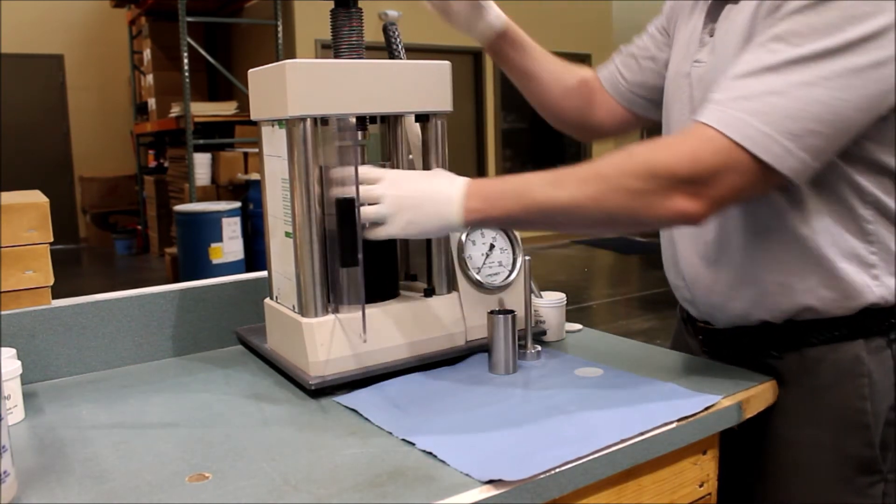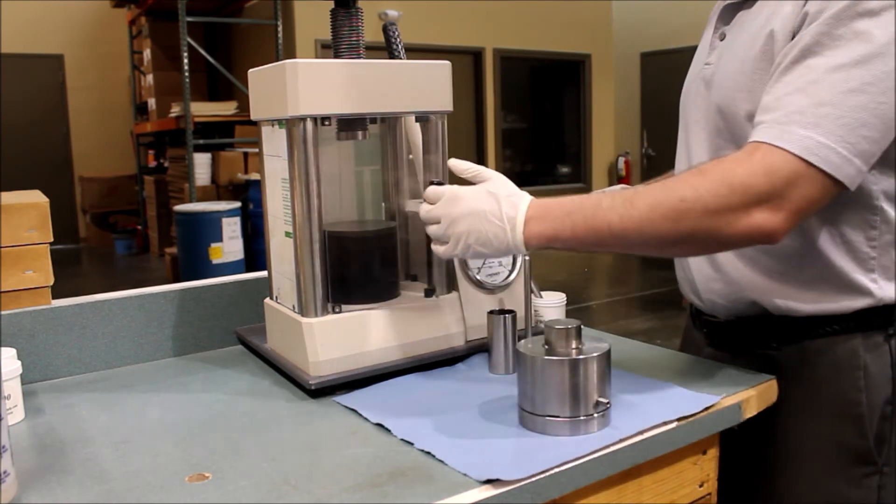From there, remove the die set and remove the plunger from the cylinder. This will make removal of the base easier.